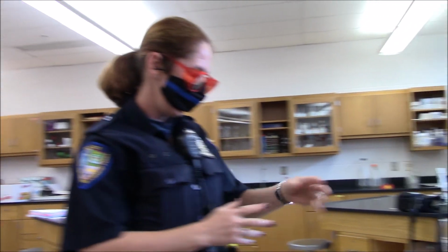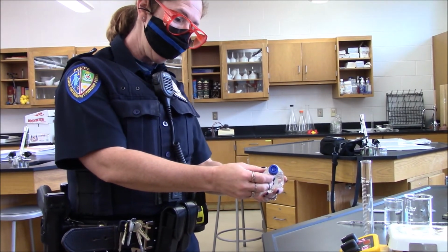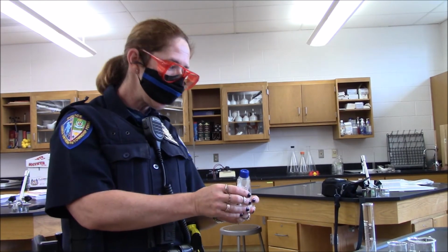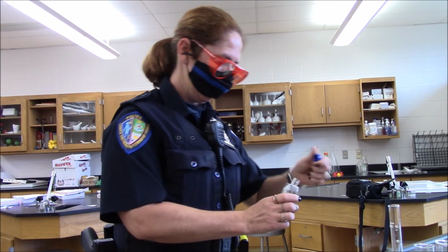Oh, hey there, guys. Look, it's Officer Beth. She came to do an experiment for us. Officer Beth, would you mind telling us which sample you're going to be testing? I have water number 4 from Ambler. Could you start by emptying it into the cylinder and reading its volume?